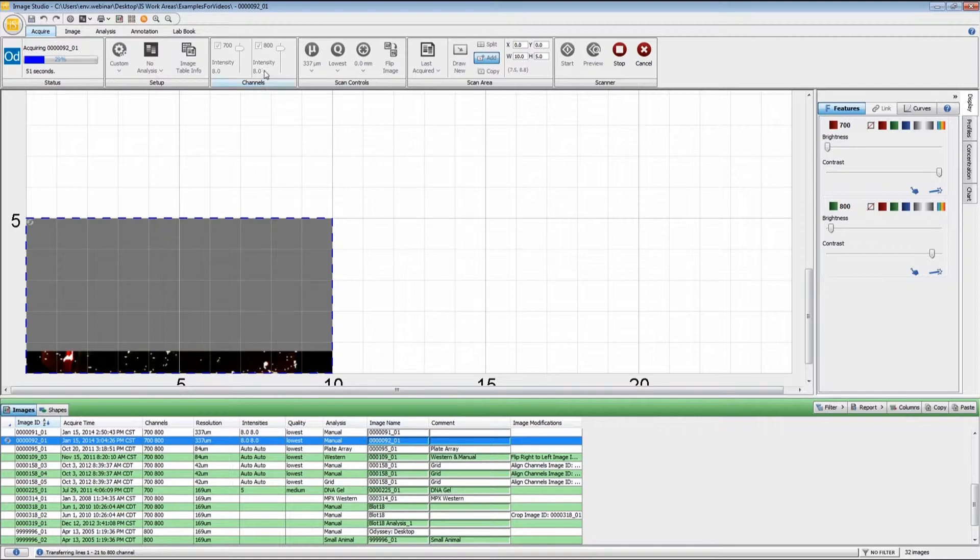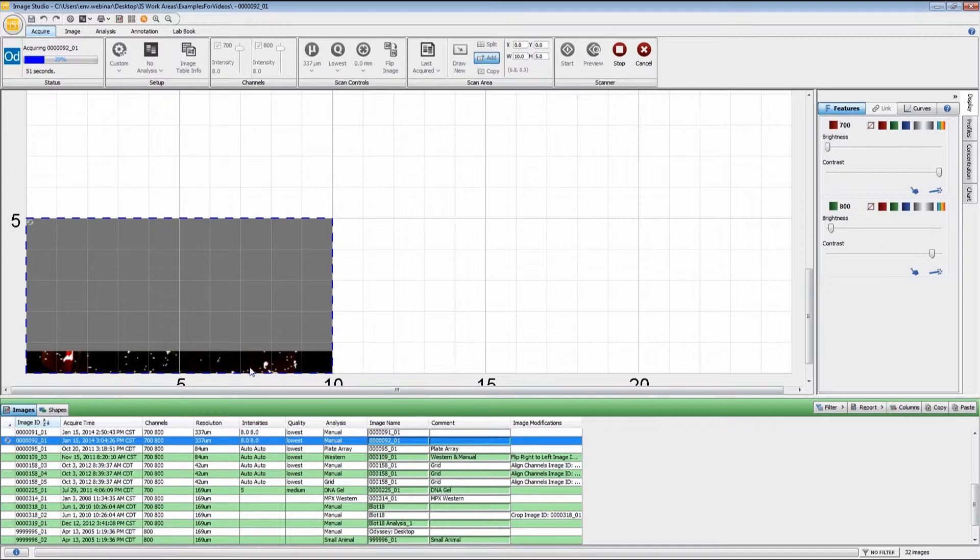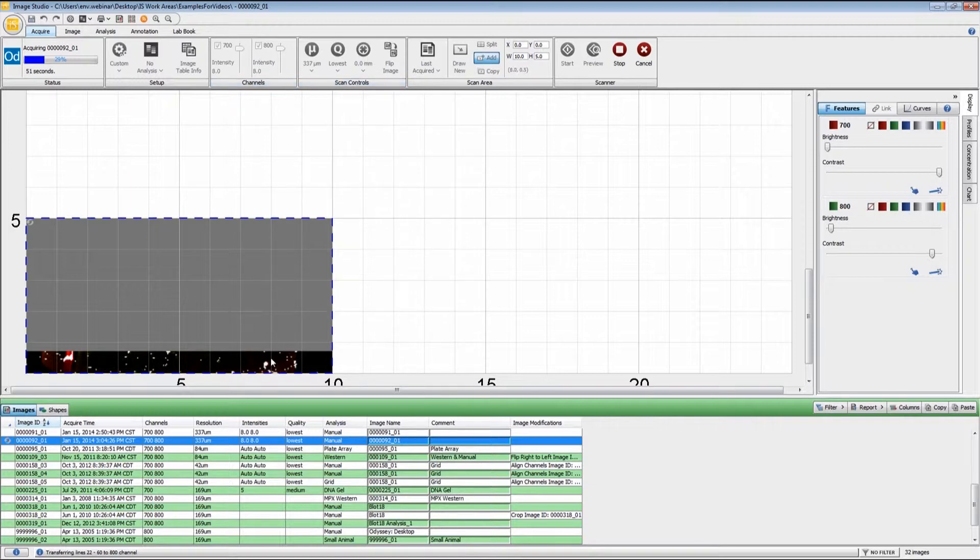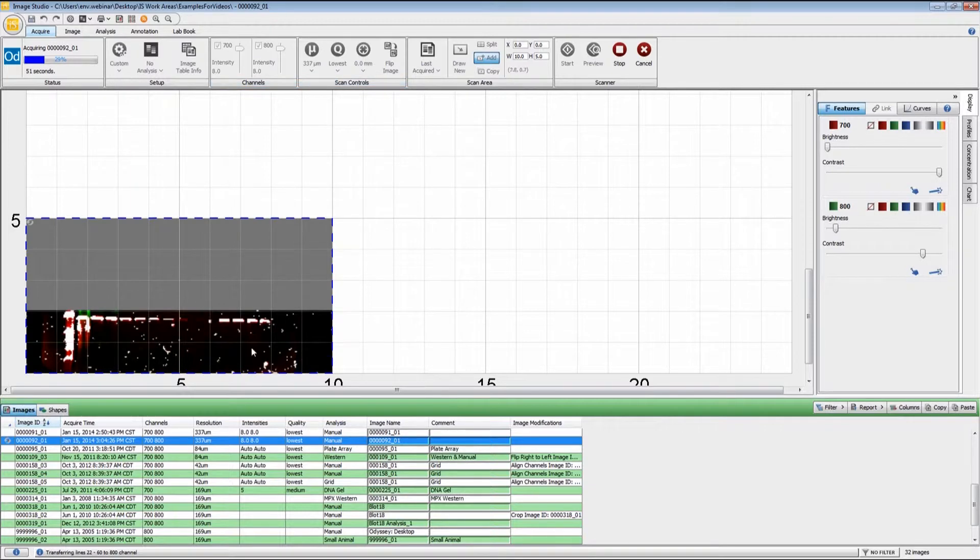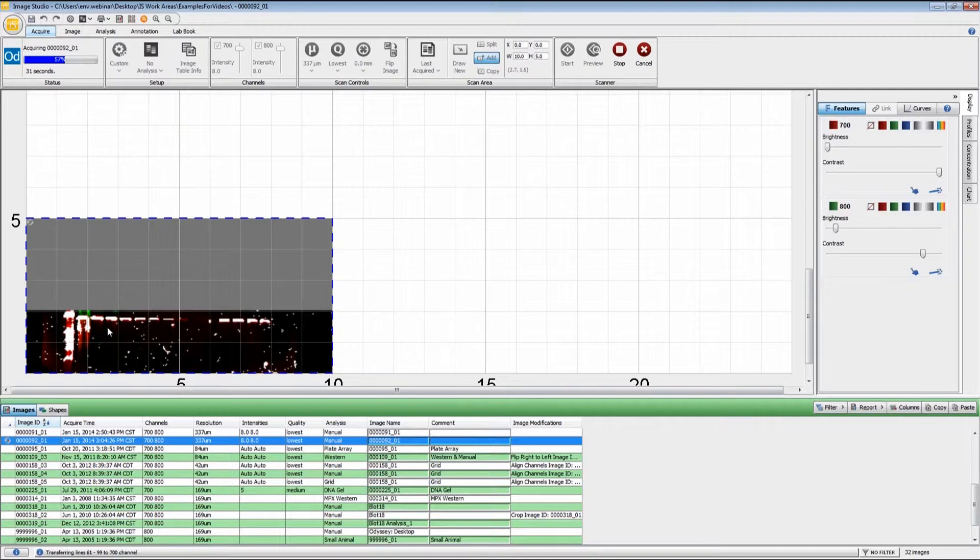This is what I was talking about with having the intensity set too high. We have a lot of saturations on the image and also with the 337 microns, it has some very jagged pixels. I'm just going to let this finish scanning and use this to fine tune my scan area once it has completed.